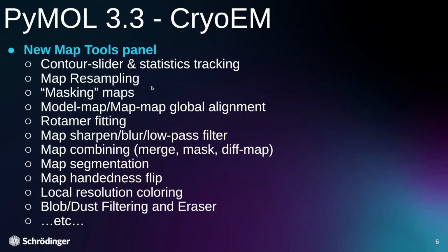You can also resample your map, perform map masking, perform map or model-map global alignment, and some basic rotamer fitting, which I'll go over if we have some time.